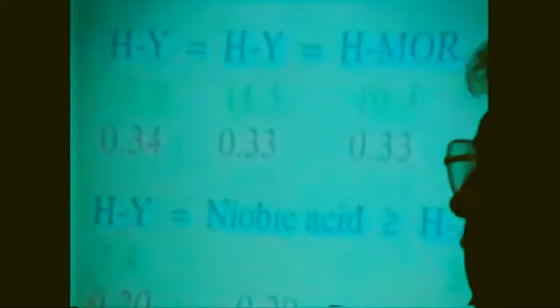And when we have really low acidity, it's possible to use the strength of the hydrogen bond, because I told you that it's possible to define not only the concentration of the different species, but also the distances inside each magnetic configuration. When you have an isosceles triangle, because you have a hydrogen bond between water and hydroxyl group, you are able to determine the distance inside such an isosceles triangle, that means the distance between the two oxygen atoms, and so the strength of the hydrogen bond. And when you have a very low acidity, you can use this hydrogen bond strength for determining the acidity of the solid. So we now have an acidity scale that we can use from non-acidic solids at all till superacidic. Thank you very much for your attention.